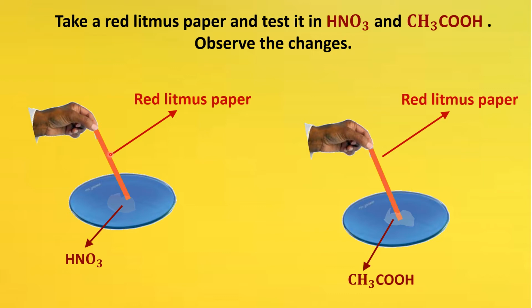It remains as it is. It has not changed its color. Red is red itself. Now we'll see with the blue litmus paper.